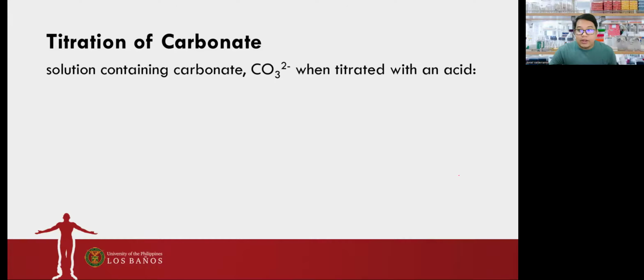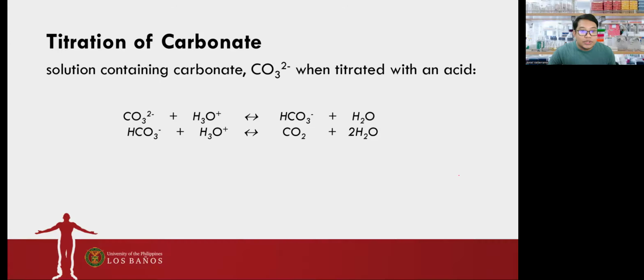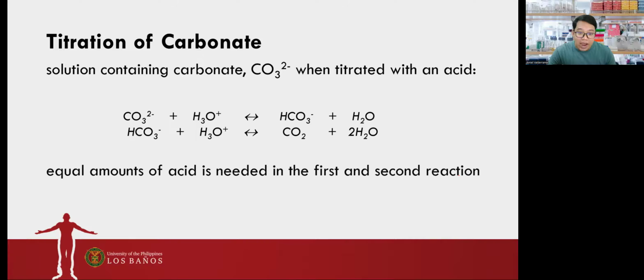Then as we titrate the carbonate mixture, the solution containing the carbonate ion, when titrated with an acid, requires equal amounts of acid for the first and the second reaction. So yung ating carbonate ion, more likely galing yan sa ating sodium carbonate. Okay? So yung sodium carbonate, when dissolved in water, you form your CO3 2-. That CO3 2- can react with your acid.